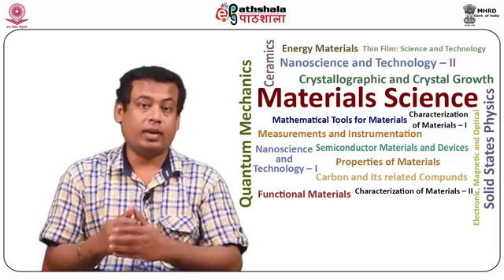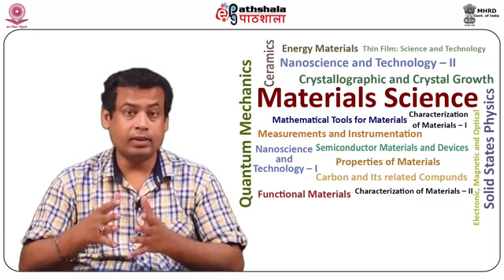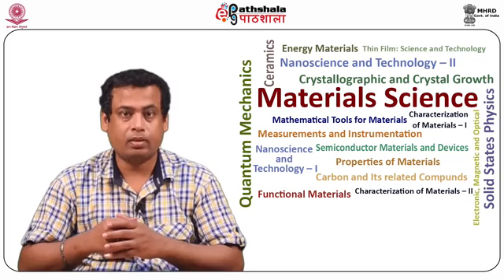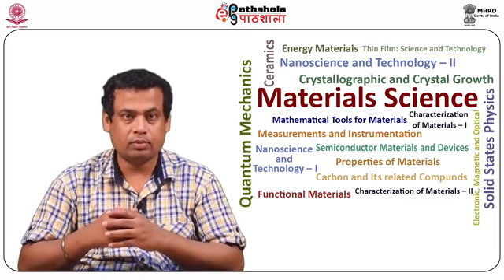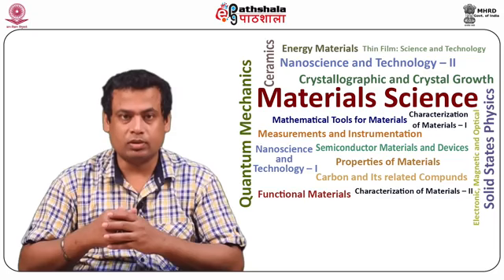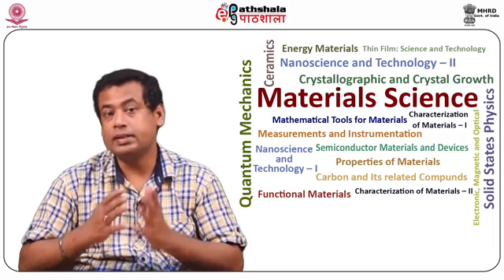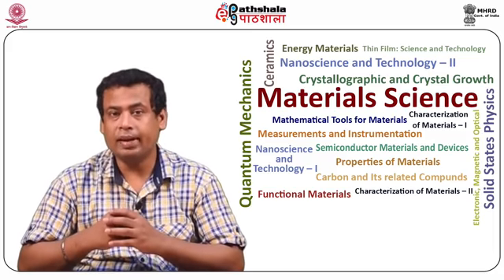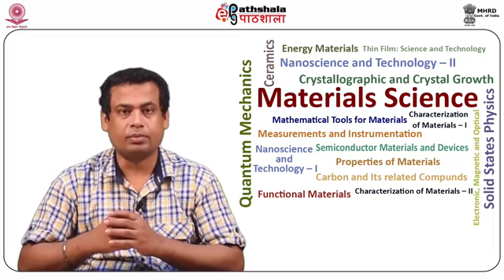Thin films play an important role in making devices and also in many analytical works, including analysis of organic-inorganic interface, role of substrate in thin film deposition, low level doping determination with the other elements, etc. The main feature of such a spectrum is that both the front surface and the interface can be probed with better accuracy by this technique, unlike in a thick sample where only the front surface is recognizable.